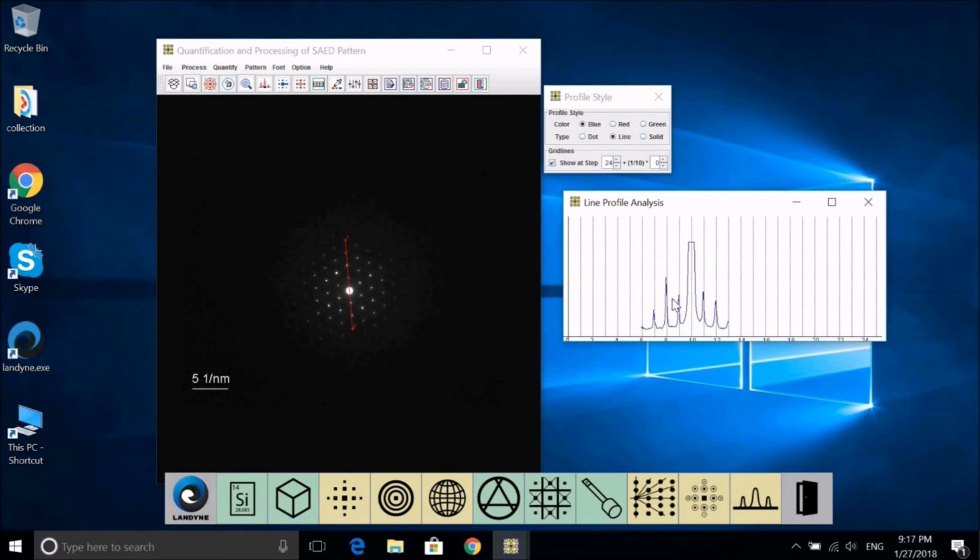And if you drag down, you can adjust the overall height of the peaks. If we choose another line, we start at the first point here, and the end point here. And you can see the same thing happen here. So this is the measurement for the profile.